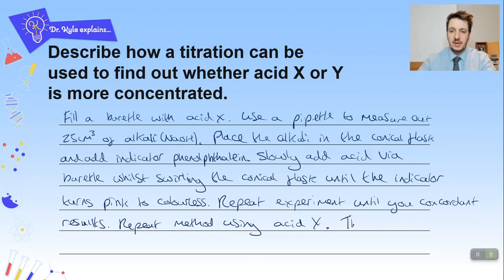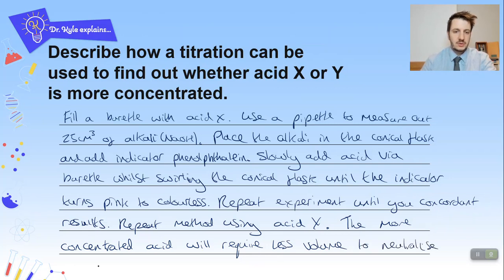So the more concentrated acid will require less volume to neutralize the alkali and change the color of indicator.